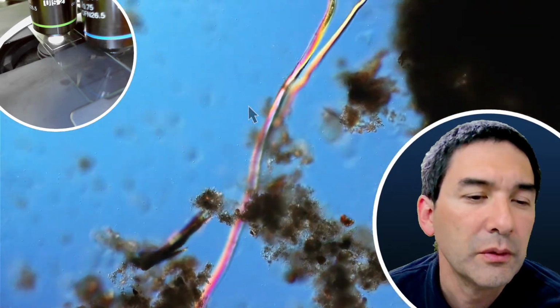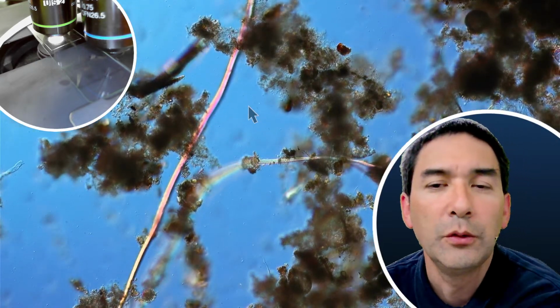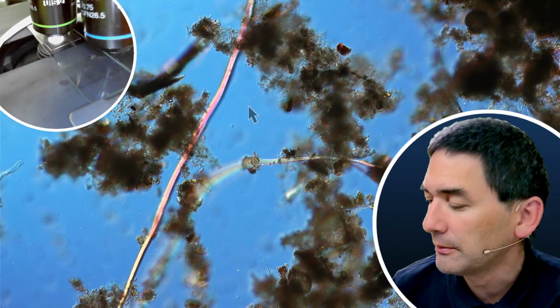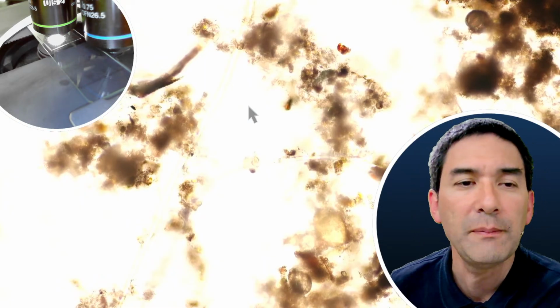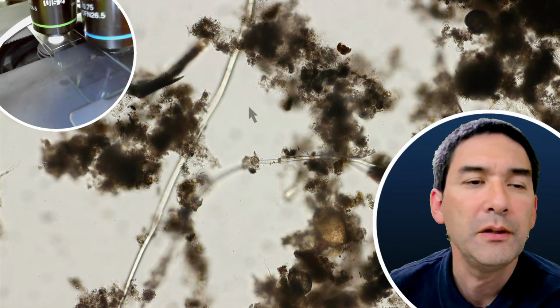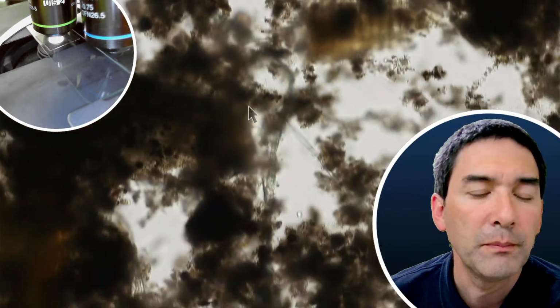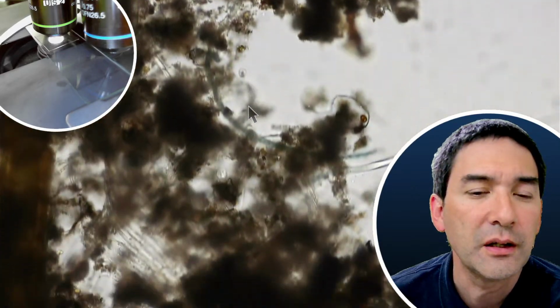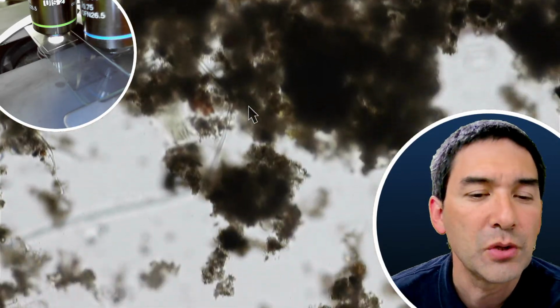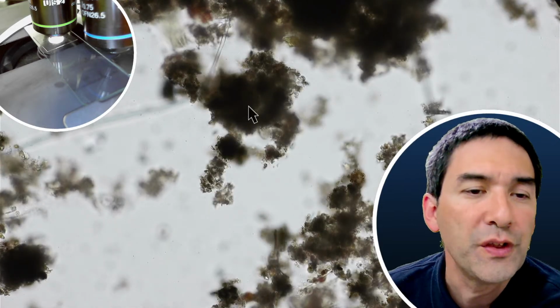So let's have a look here. I'm using now DIC illumination, and this DIC actually does change the colors a little bit. So what I'm going to do now is flip out the filter, and it might now appear to be a little bit more boring, but you are able to see the colors as they are naturally, and this sometimes also helps to find photosynthetic organisms.